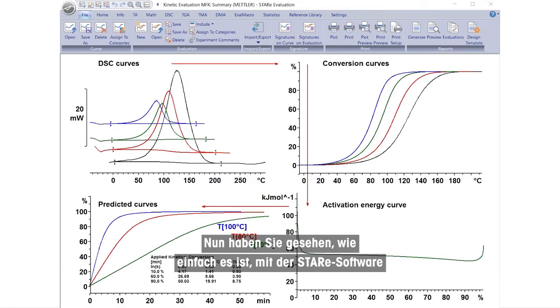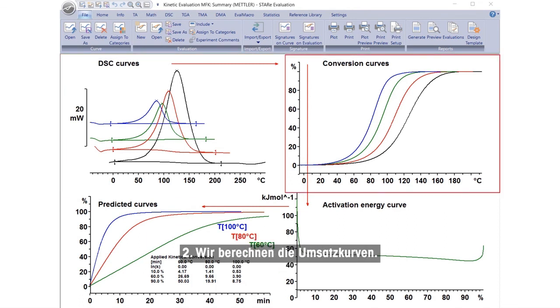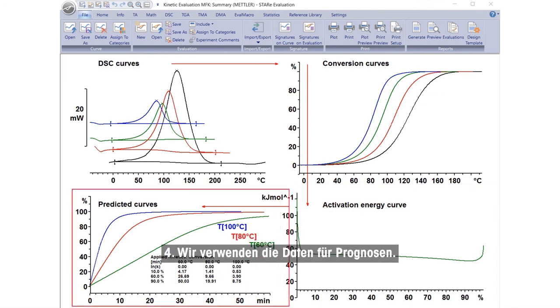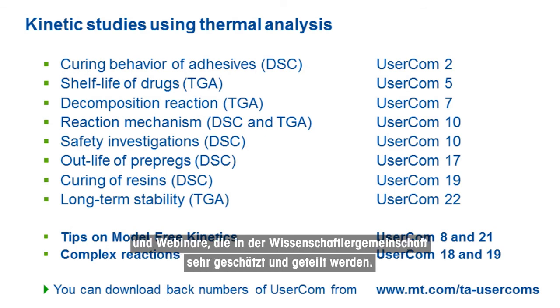You have seen how easy it is to predict reaction kinetics using Mettler Toledo's STARe software. The diagram is a summary of the four steps. One, we define the reaction peaks and draw baselines for the integration. Two, we calculate the conversion curves. Three, the conversion-dependent activation energy is calculated from the conversion curves using MFK. And four, we use the data to make predictions. For more information on the topic of kinetics, we recommend you to refer to our UserCom articles and webinars, which are highly appreciated and shared among the scientific community.